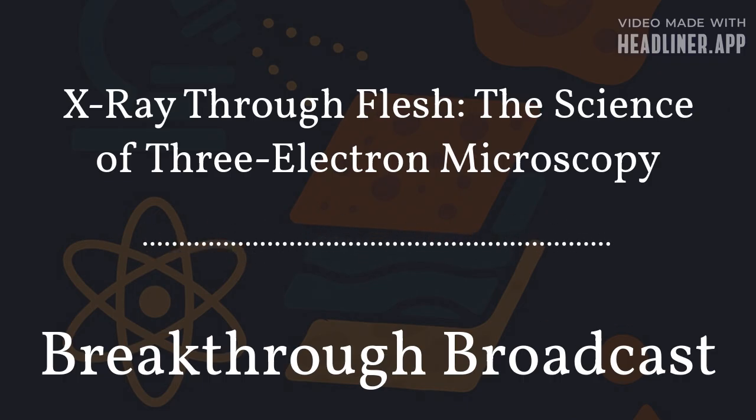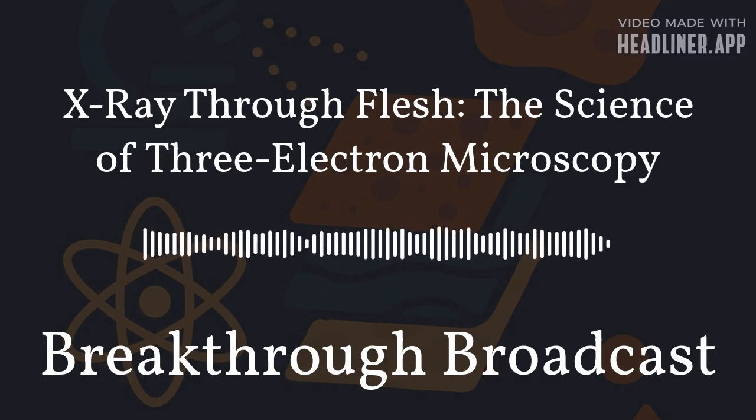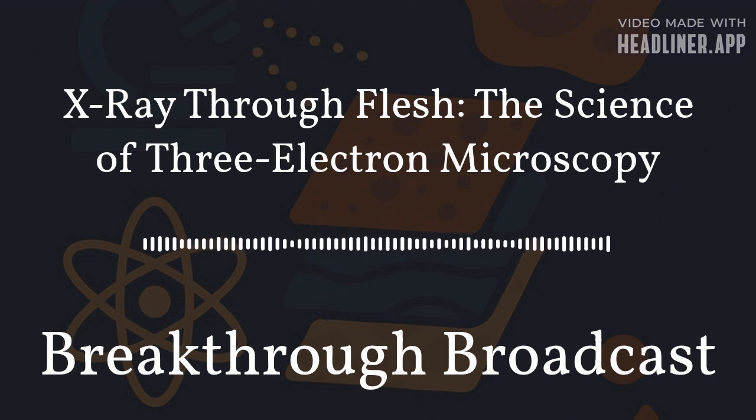Hi, I'm Drew, and in this episode, we're exploring a technology that pushes the boundaries of what humans can see. Three-electron microscopy. It's a method that reveals the inner architecture of biological tissue with a clarity that didn't exist until just a few years ago. Instead of relying on a single type of electron signal, or even two different types, this technique collects three distinct electron interactions from the same sample and merges them into one unified, highly detailed image. The result is a view of the microscopic world that is rich, layered, and scientifically transformative.